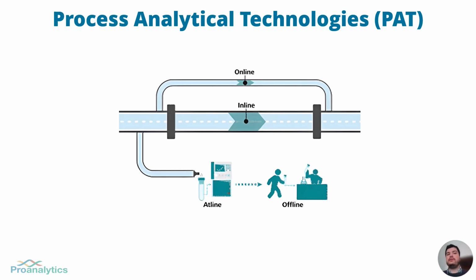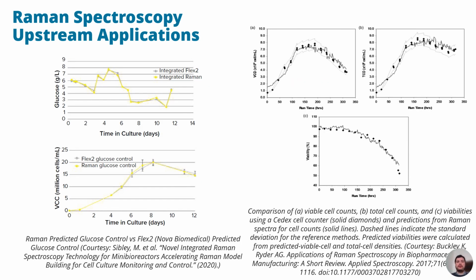The final goal of the PAT is to integrate different aspects of bioprocessing, such as chemical, physical, mathematical, and biological analysis. Spectroscopic methods are one of the most employed PAT tools, and Raman spectroscopy with the relevant mathematical models is one of the most prominent measurement techniques in monitoring bacterial, yeast, and mammalian culture systems. Some of the important parameters to measure are cell viability, viable cell density, glucose, amino acid, and product concentration. Raman spectroscopy is one of the biggest PAT tools in the upstream and downstream bioprocessing.